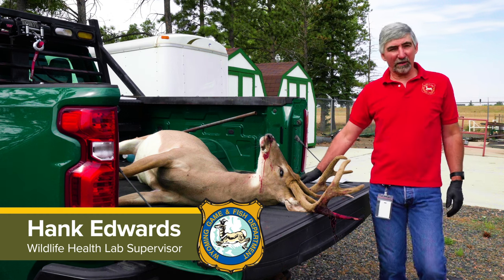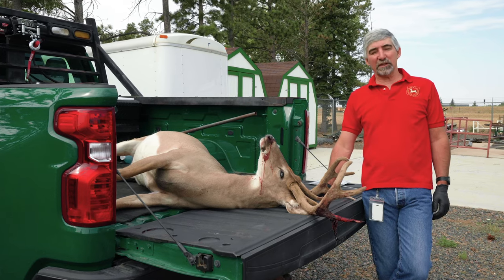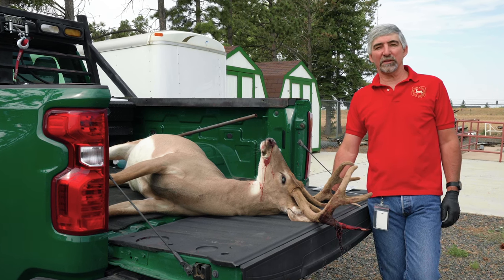Hello everybody. I'm here today to show you how to take lymph nodes from your harvested animal. The process is going to be the same whether it's a deer, elk, or a moose — the lymph nodes are in the same location. I'll run you through pretty quickly on how to extract those lymph nodes. It's important that we receive those lymph nodes because it really makes a big difference on how we're able to monitor this disease.